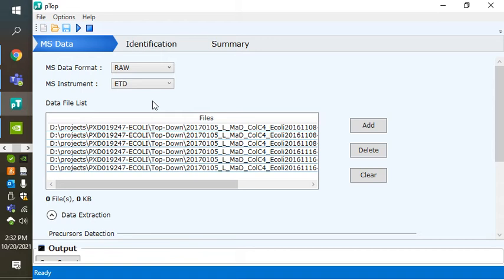So you get c-z pairs, and in some cases, the complex of the c-z pair has been kind of tickled apart with a little bit of RF, basically, a little bit of HCD. So the resulting fragments should be dominated by c-z pairs, but there's some possibility that there will also be b-y pairs.